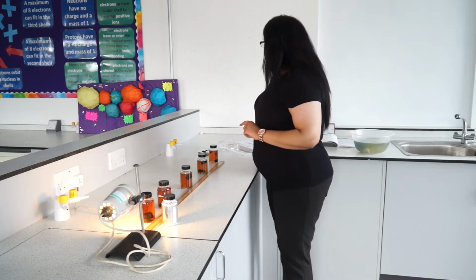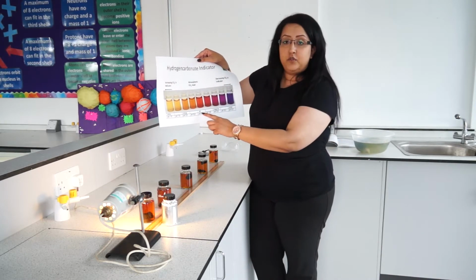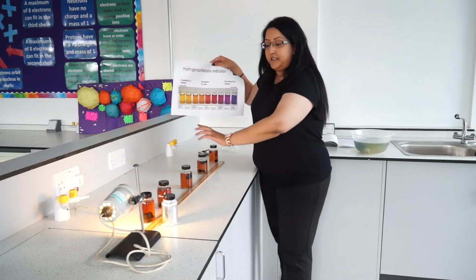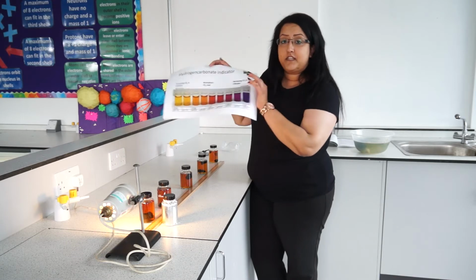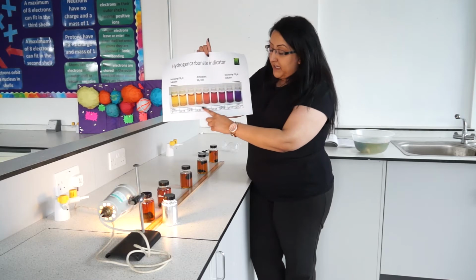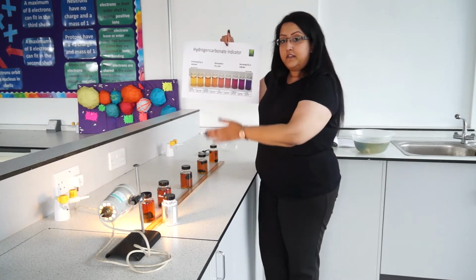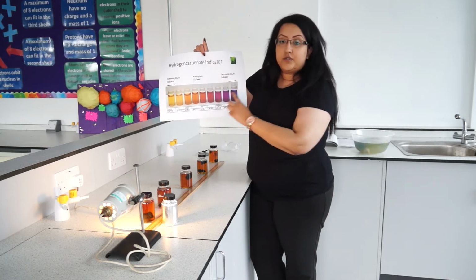What you need to make sure you do in your lab book is match this colour to a pH level and record this down. So for the one 10 centimetres away, 25 centimetres away, 50, 75, a metre, and the control one, you write down what pH you think that is. You'll be given this indicator guide to help you. So at the start of the experiment, you write down what pH you think it is according to the colour. At the end of 60 minutes, you go back to all of these, 10 centimetres, 25, 50, 75, 100, and you write down the pH it is now according to the colour change.